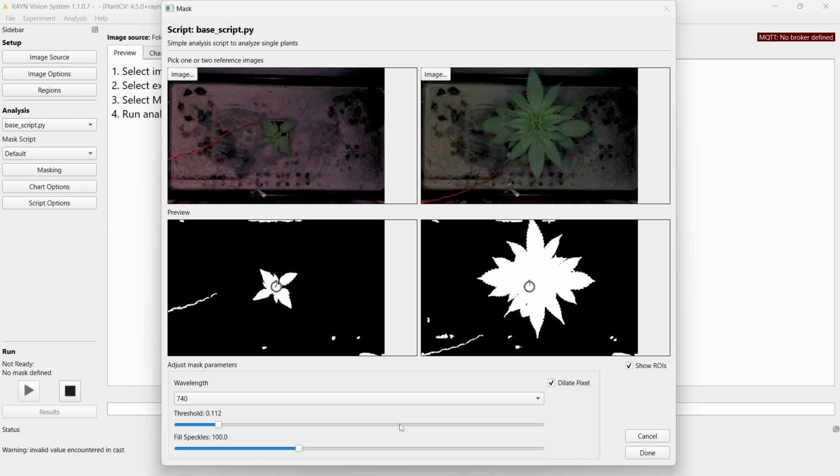And I think actually this should be fine. Right, so it basically catches everything we need. I don't want to go into details right now. We can make another video about how to set your masks perfectly.